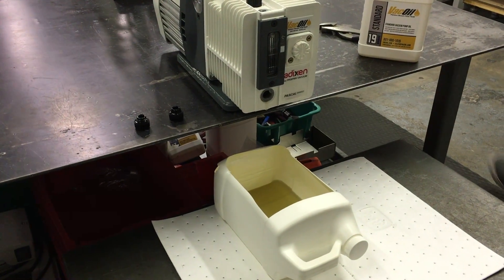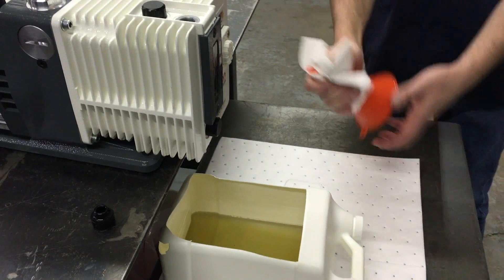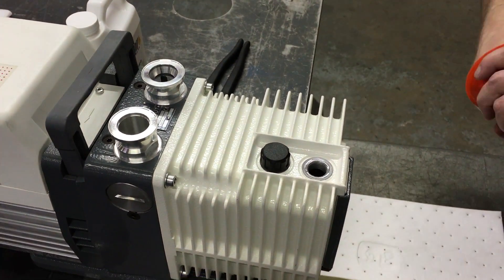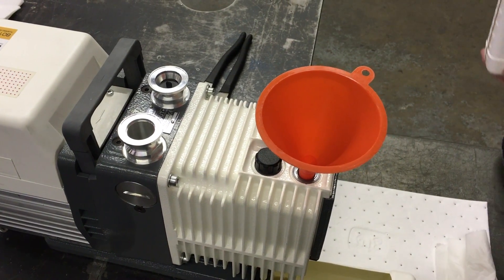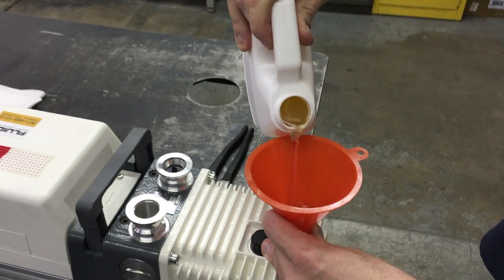Next, use a clean funnel to add new vacuum pump oil. Make sure to clean and dry the ports and plugs with a clean rag. Always use a high quality vacuum pump oil. I know this is obvious, but replace the drain plug before you pour the oil back into the pump.